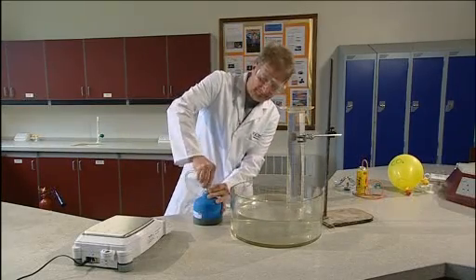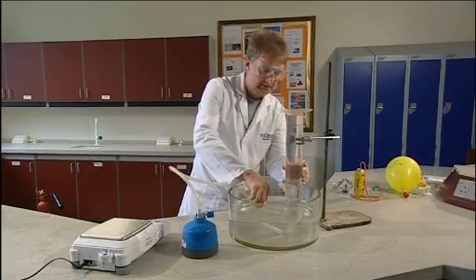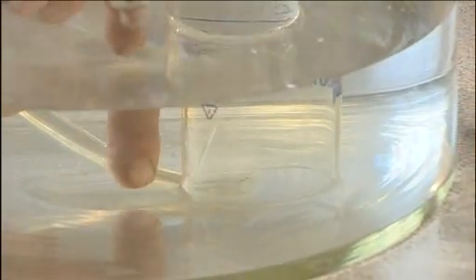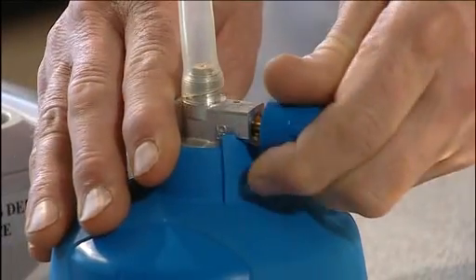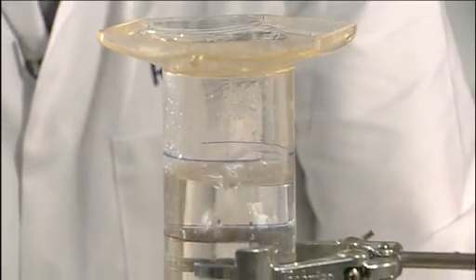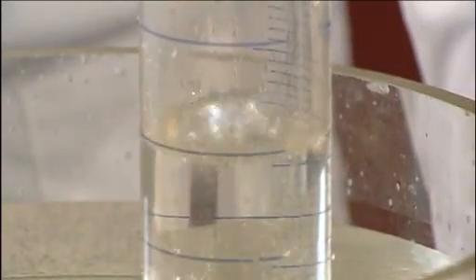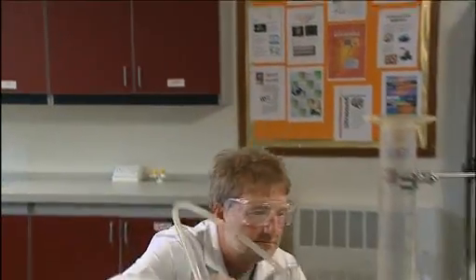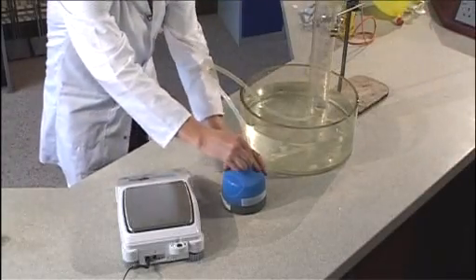Replace the delivery tube and place it so as to collect gas by displacing the water in the cylinder. We now collect a cubic decimeter of the gas. Once we've collected a cubic decimeter of gas, we can remove the delivery tube.